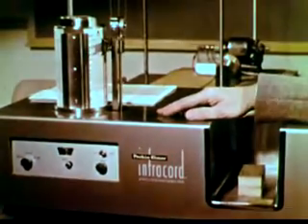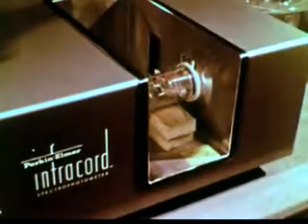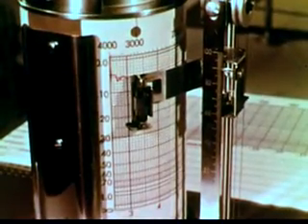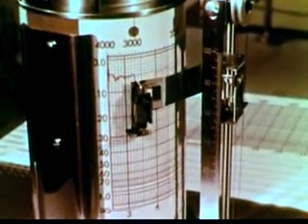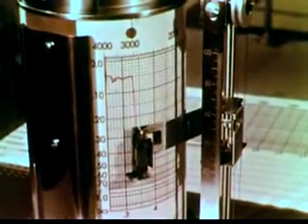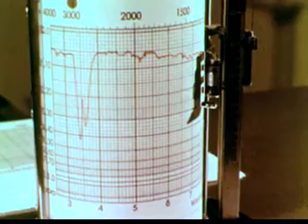For our first infrared sample, let's try a simple molecule, HCl in the gas phase. We start recording and scan to lower frequencies. The HCl sample is transparent at all frequencies until we get to 8.67 × 10^13 cycles per second, where the sample absorbs quite strongly. The quanta absorbed have an energy of about 9 kilocalories per mole. At lower frequencies, the HCl is again transparent.